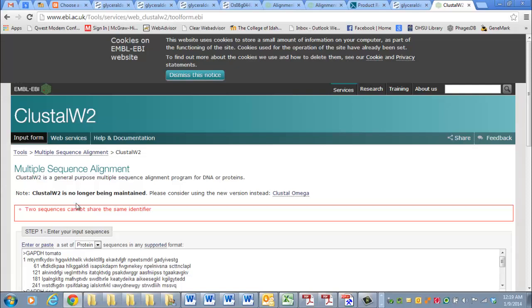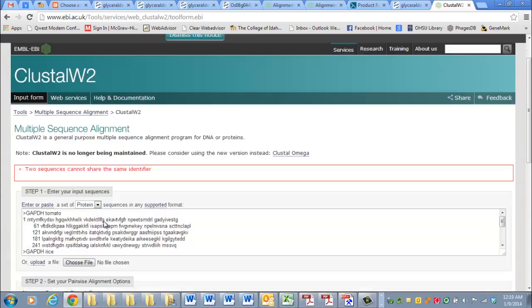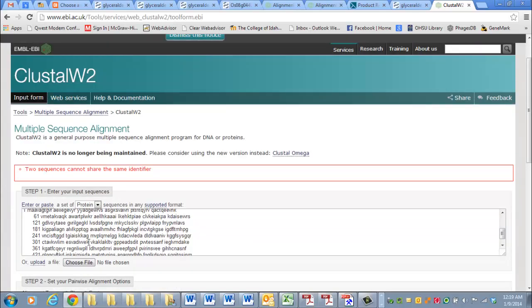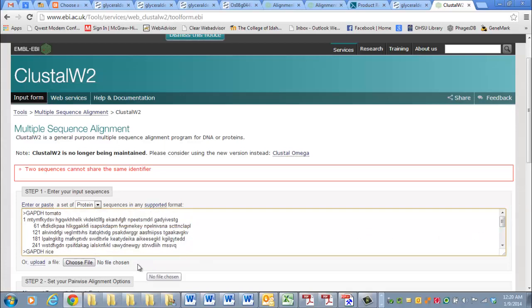two sequences cannot share the same identifier. I forgot to do one thing. I'm doing this in one take, you guys, so I'm not going to go back and edit this out. This has to be one single word, I believe. You can't have any spaces. Hopefully that fixes it.